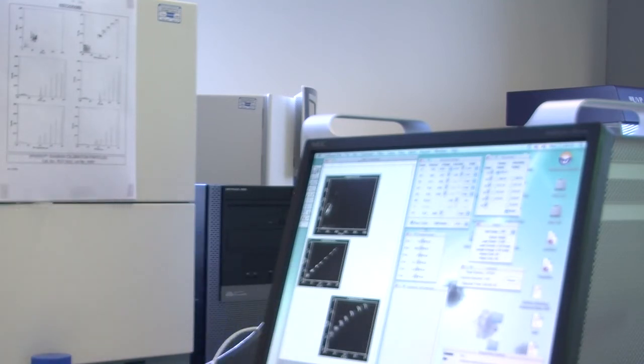These red lasers are a bit flaky. The red laser, I think, is beginning to go. I think it's on its way out. I mean, it's fine, it'll work, but I wouldn't want to be using it for really critical experiments and really critical data. Yeah, I know. I mean, we'll get data, but it's just the sort of thing that, yeah.